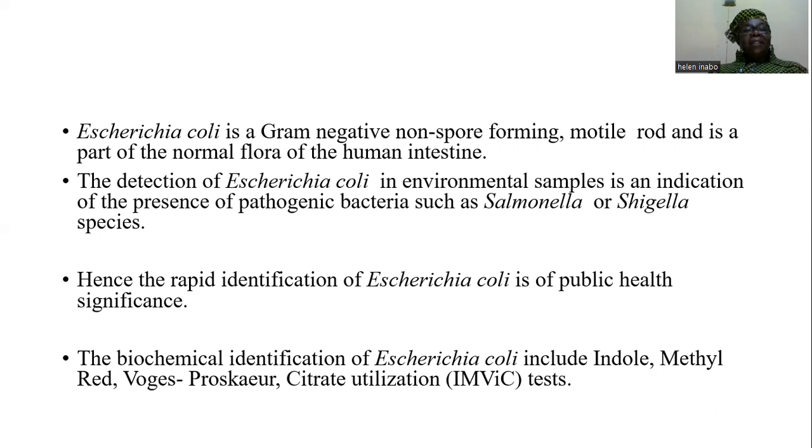adequate medical attention. The detection of E. coli in environmental samples is an indication of the presence of pathogenic bacteria such as Salmonella or Shigella species. Hence, the rapid identification of E. coli is of public health significance.